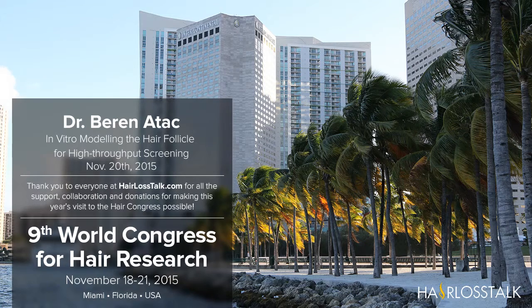Then we also wanted to look into the layers we could see in the light microscopy. What are they? We could clearly see a distinction between inner and outer root sheath organization within the organoid. So we then looked in more detail at what types of keratins it expresses.